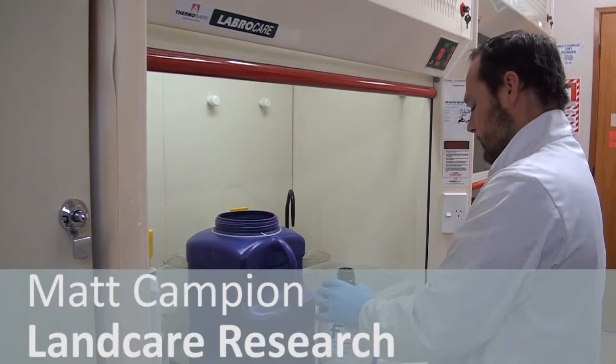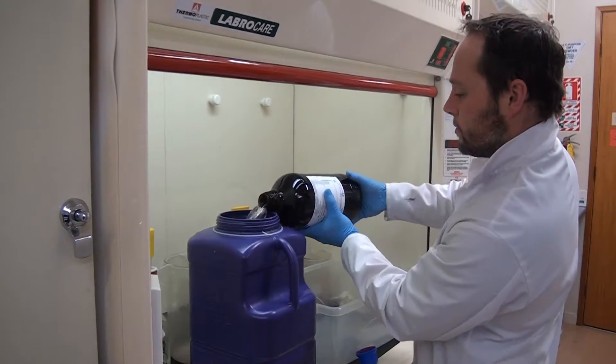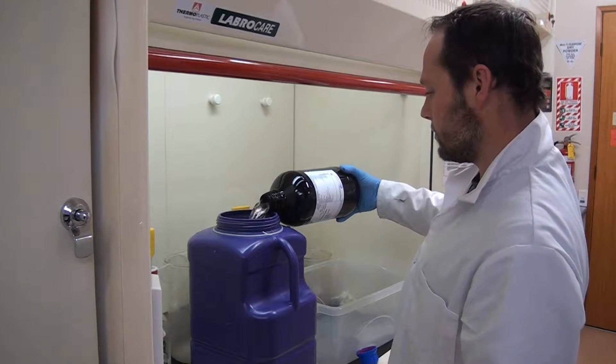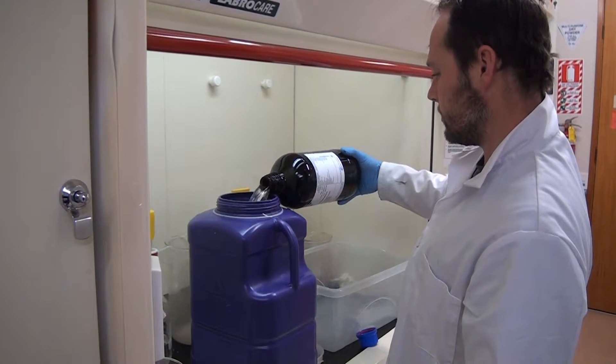I've just been using a simple solvent extraction. I've used a combination of solvents selected for their low boiling point and basically what's called their polarity, like whether it's soluble in water or organic solvent.